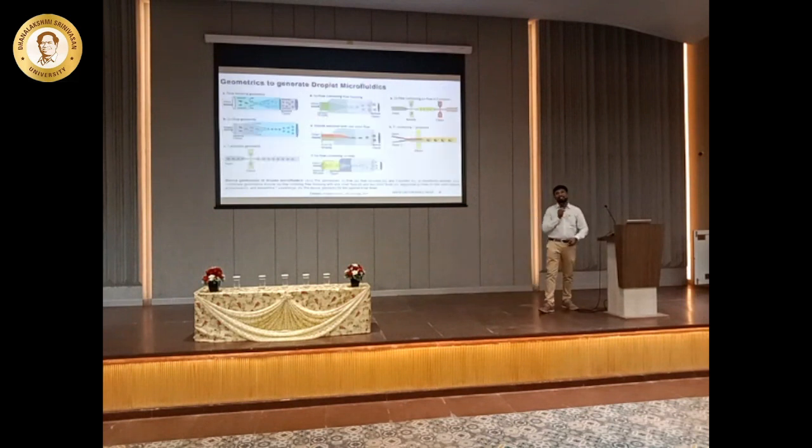So how do we design this microfluidic droplet formation? We have varieties of designs that can be created. Sir, is that only one design? You showed only one design. The previous was only one design. It's just a T-junction. You have oil and you have water that can interact, and it starts forming droplets. But this is not the only way. We can create droplets in several geometries. See, everywhere we can create droplets, but look, the geometries are different.